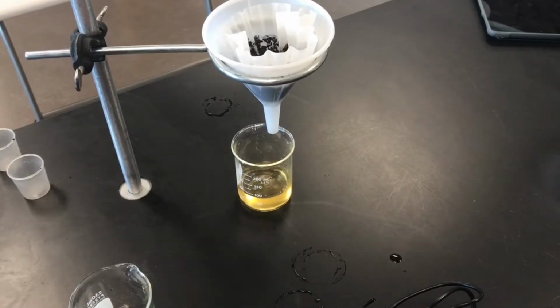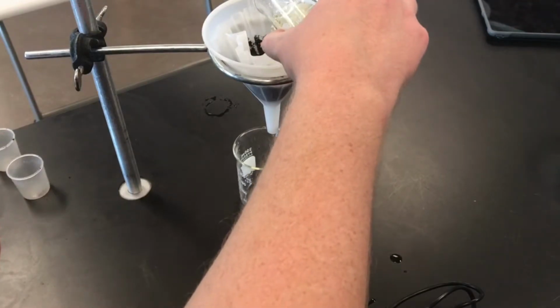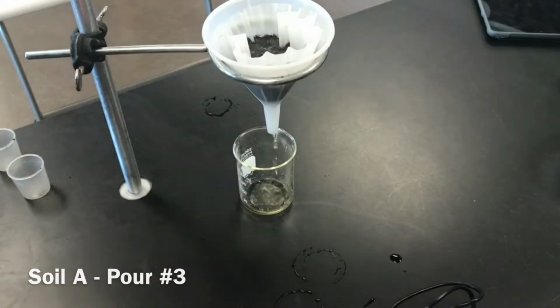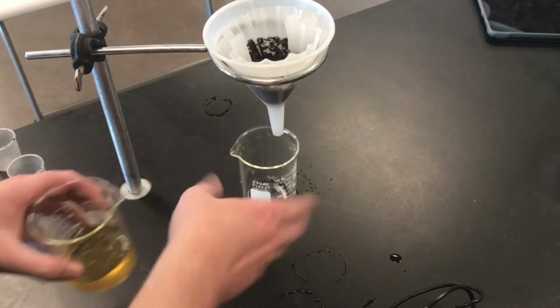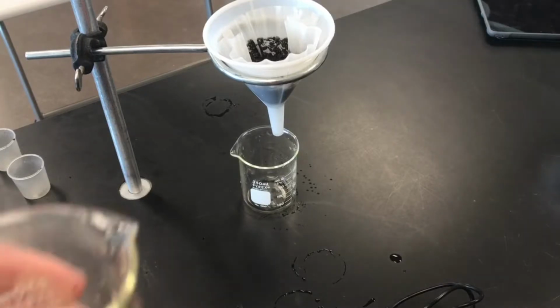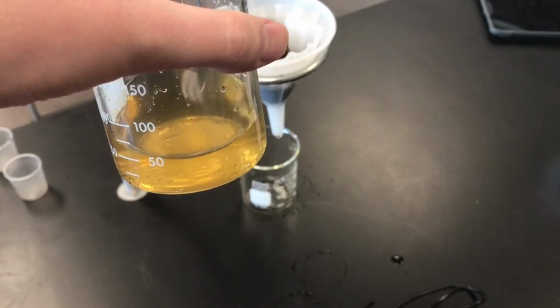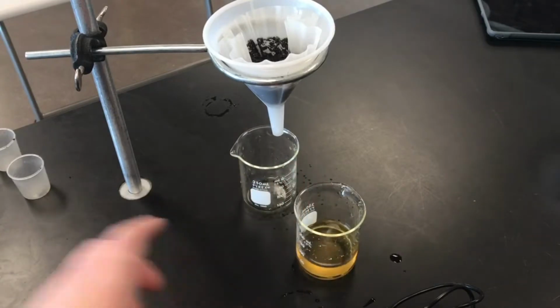Okay, so I'm going to filter this out a third and final time here. Switch your beakers out. So it looks like my third run is finishing up here. You're not obviously going to wait till every little droplet is out, so I'm just going to make sure I have something under here. This is what our solution should look like after a third run through. Nice, beautiful color right here. So this is our sulfuric acid, ran through soil A 3 times. Set that down here, and we're going to take a final measurement.